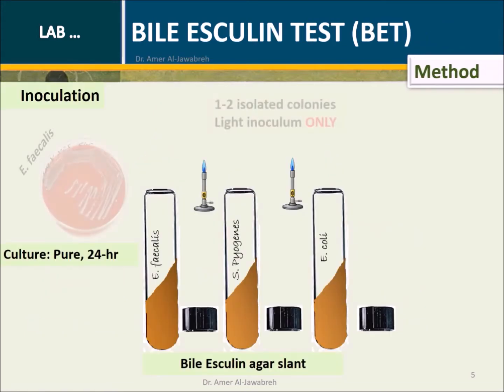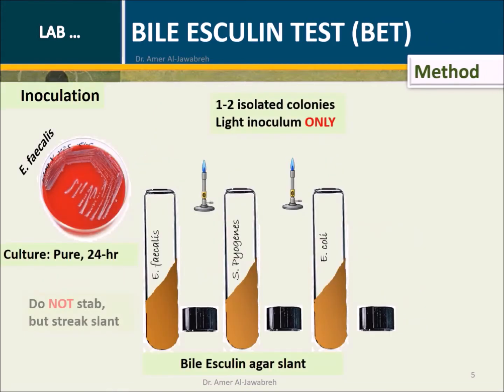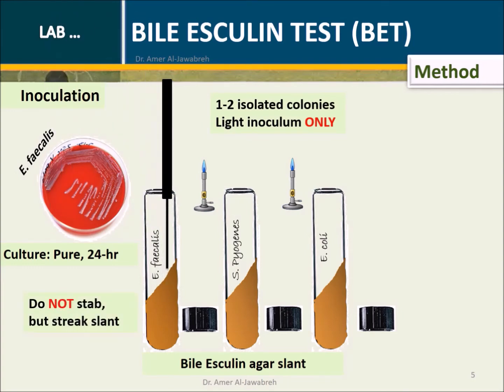With an inoculating wire loop or stab, pick up a light inoculum of a pure colony from the culture plate. Zig-zag streak on the surface of the slant. Do not stab.